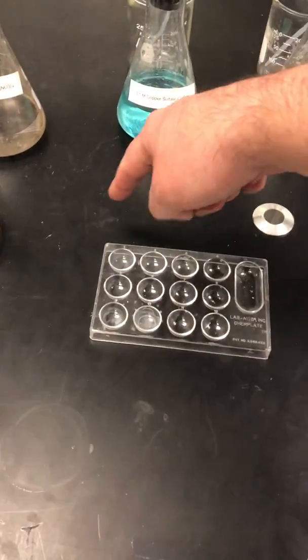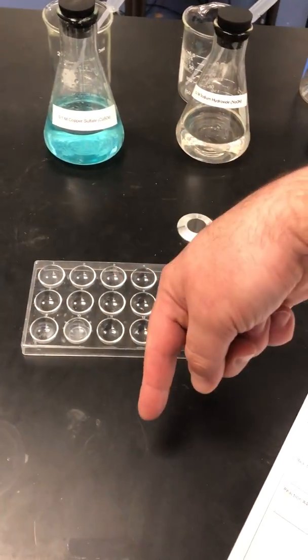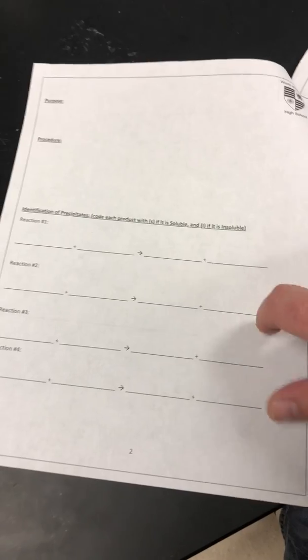This one, 5 drops this way now, 5 drops in each one in this way. This one over here, 5 drops in a third one down. And then this is what we're going to use to predict our precipitate. This is the piece you have to do first before I let you do the lab.